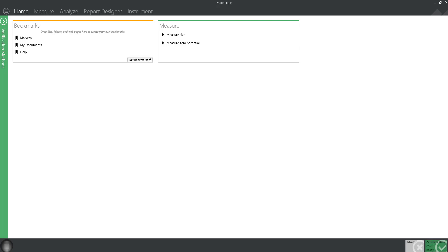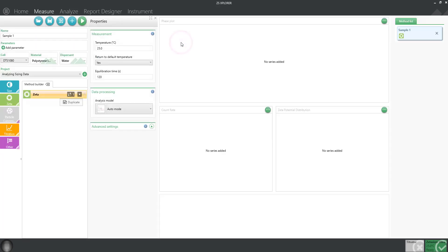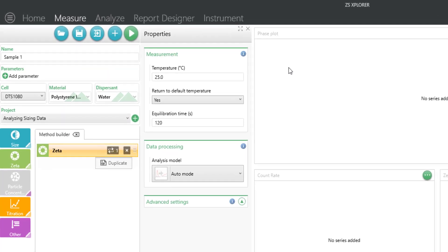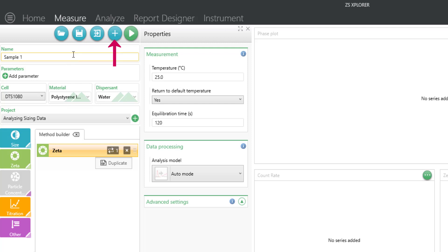To start a measurement from the home screen, you can simply click on Measure Zeta Potential. This automatically takes you to the Measure tab where you can either open an existing method or write a new method.